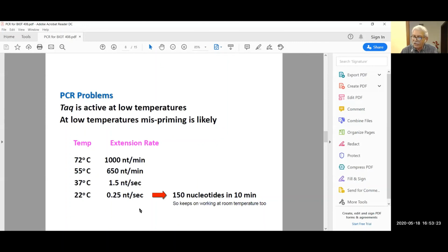You will have much higher chances of non-specific amplification. So perform your PCR reaction setup on ice, so that you have almost negligible chances of non-specific binding of your primer with a template and extension by the polymerase.